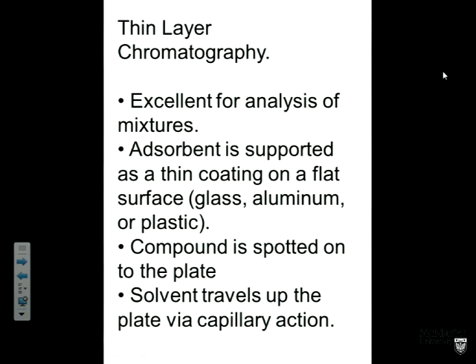So that's that. So let's suppose that we've done a chromatography column, and we've separated compounds. We've now got A and B and C. Our three compounds are separated in three separate flasks. How do we identify what is present in the different fractions that I have collected from the column? And one of the best ways to do that, or to determine what's in which fraction, is thin layer chromatography. So TLC is excellent for analysis of mixtures.